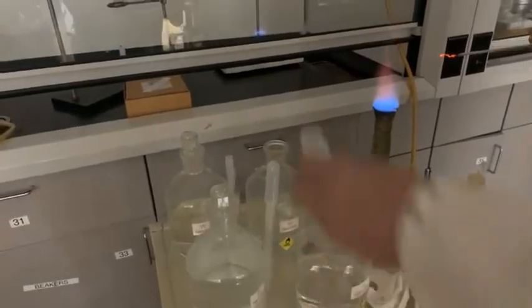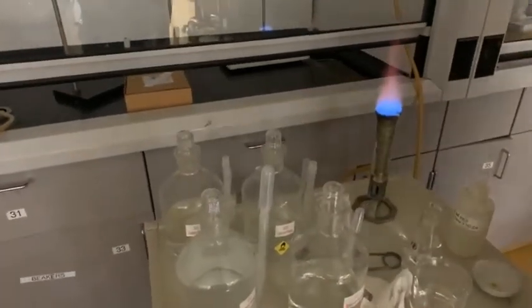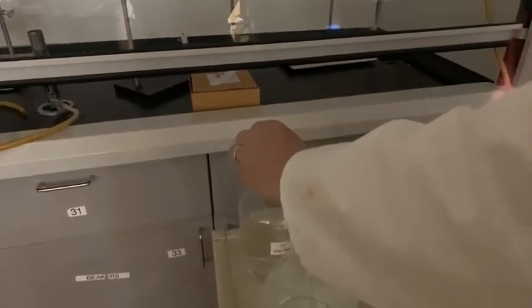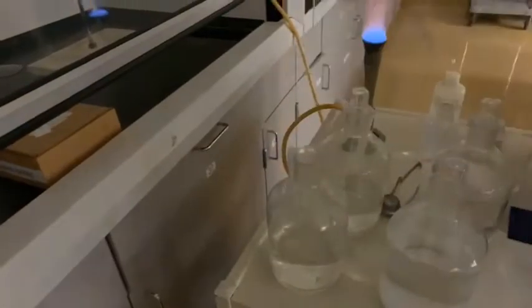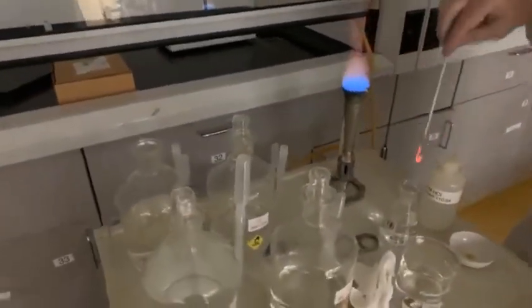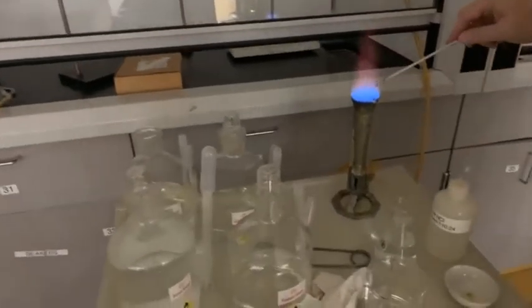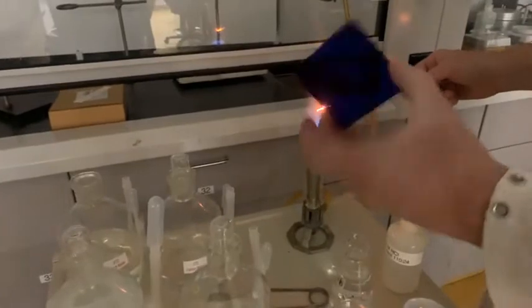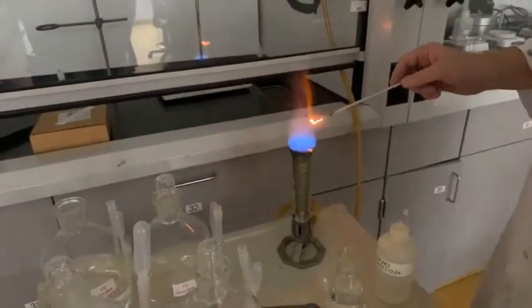So if you watch the demo of the rainbow fire, look at the calcium glow there, you get the lovely orange color. Okay, now for sodium. Sodium is so pervasive that usually once I test it, its flame never goes away, so we always save sodium for last. It is also why this lens is used, because it blocks the sodium flame from being seen.